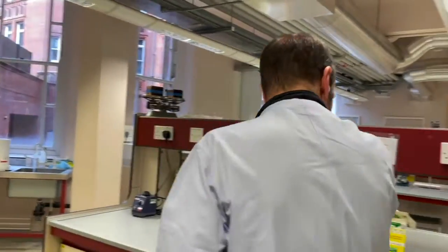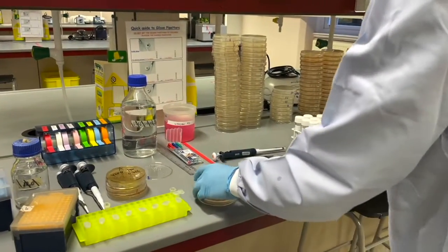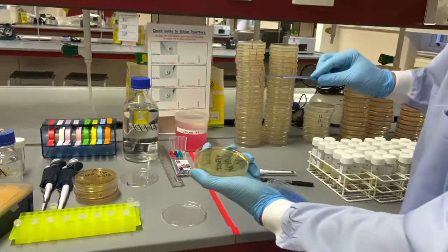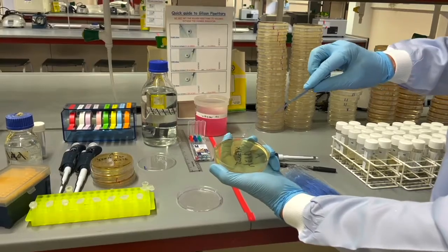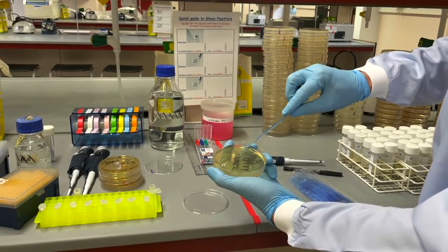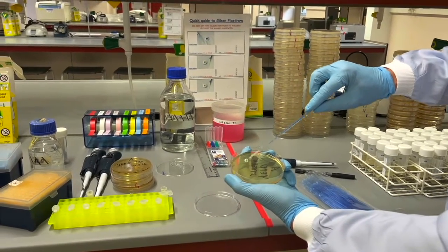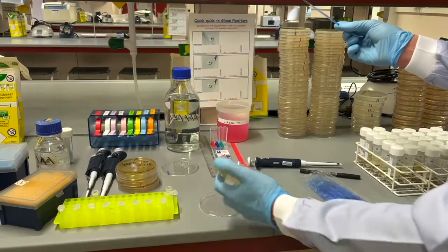Okay, that was my first one, that's my second one. So I'm going to start at the end of that streak and streak away from it, so I dilute the cells down.